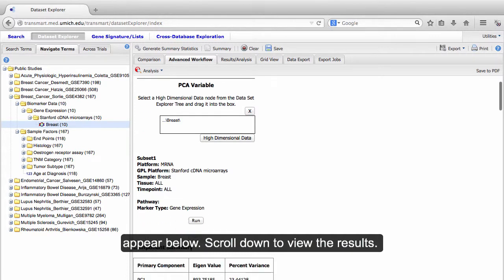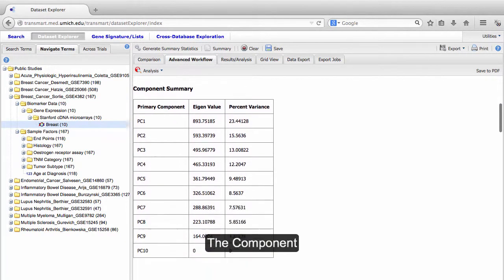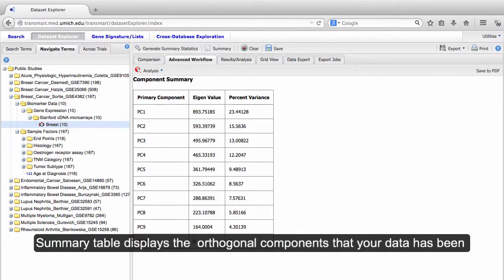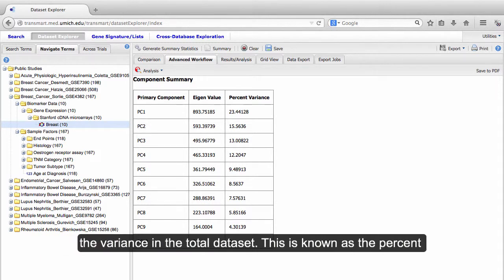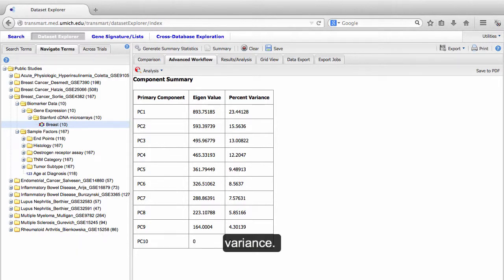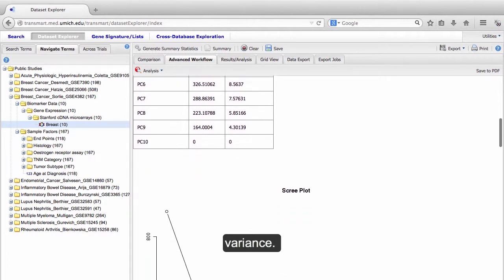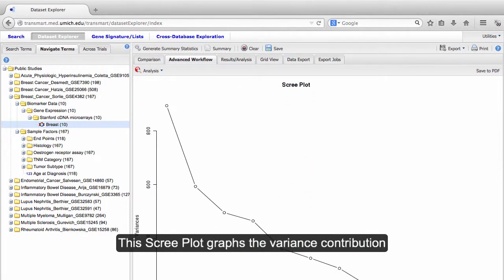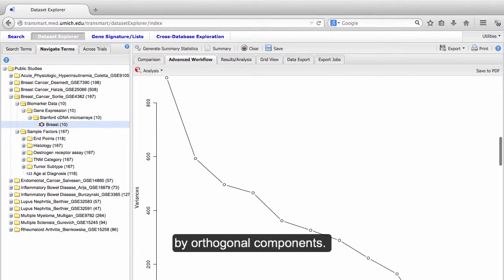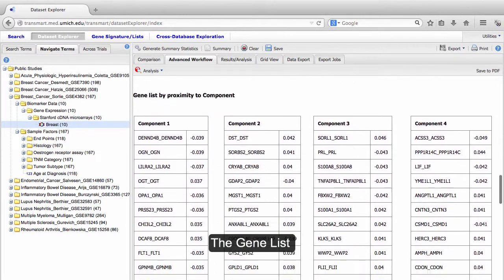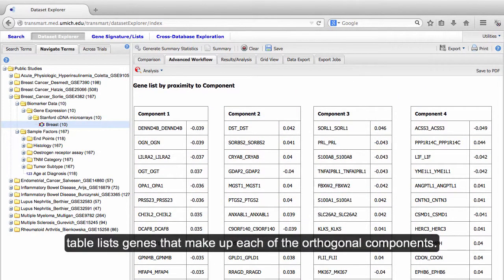Your analysis will appear below. Scroll down to view the results. The Component Summary table displays the orthogonal components that your data has been broken into, and how much of the overall variance they are contributing to the variance in the total dataset. This is known as the percent variance. The Scree Plot graphs the variance contribution by orthogonal components. The GeneList table lists genes that make up each of the orthogonal components.